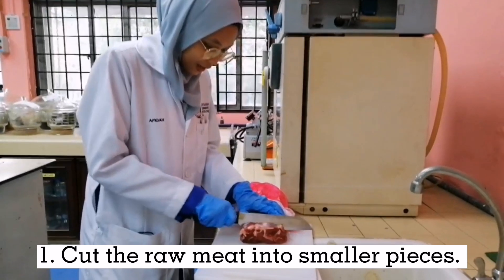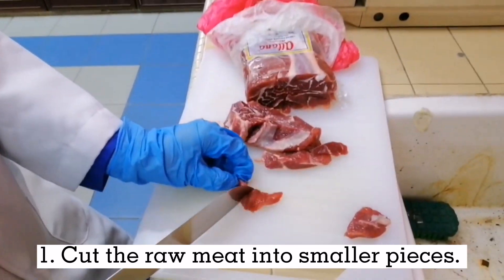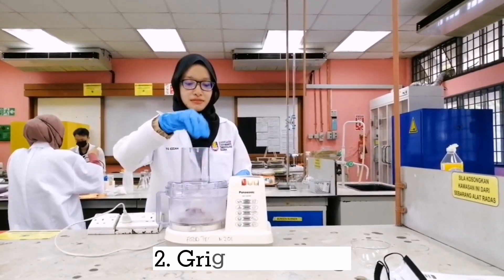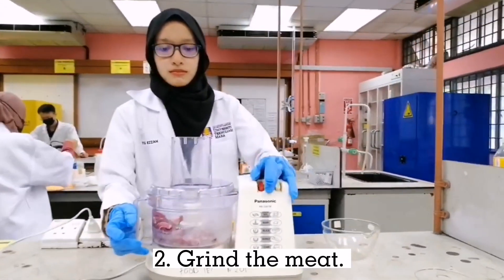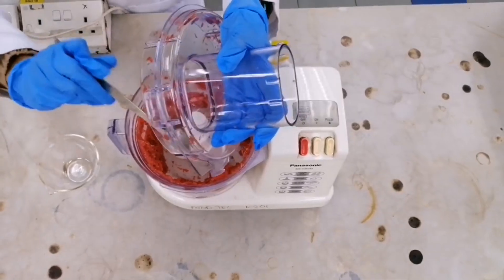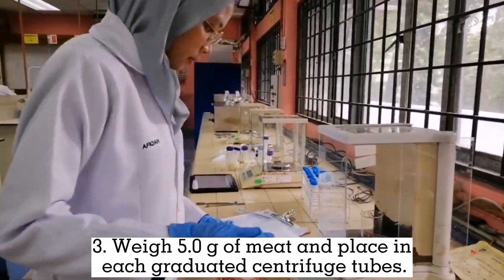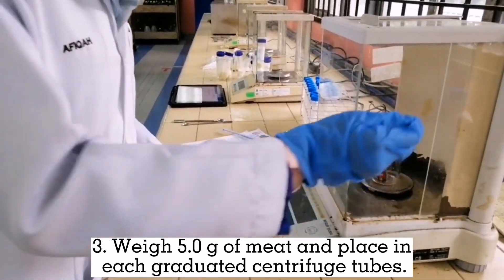Cut the raw meat into smaller pieces. Grind the meat. Weigh 5g of meat and place in each graduated centrifuge tube.